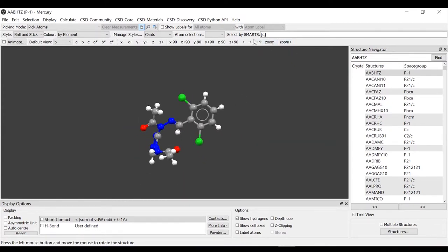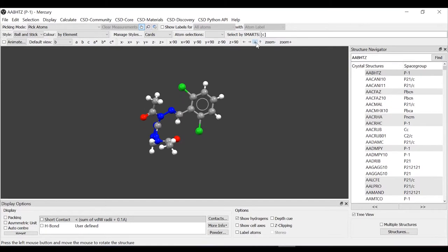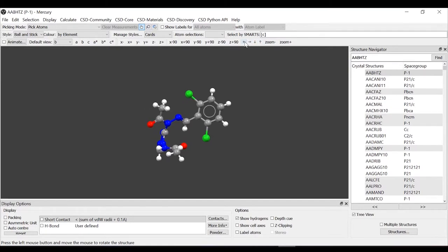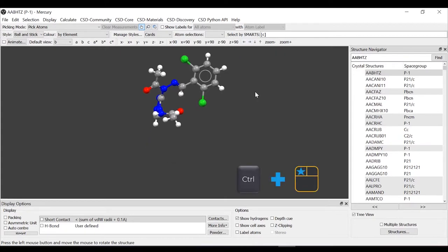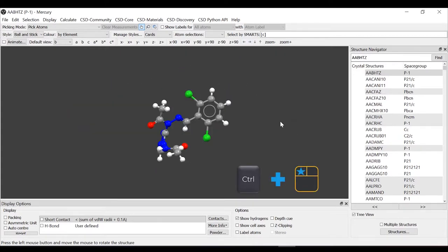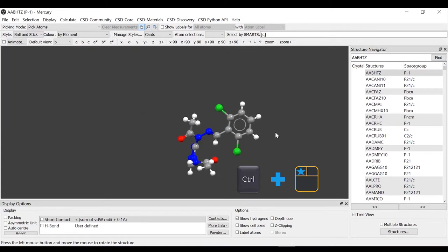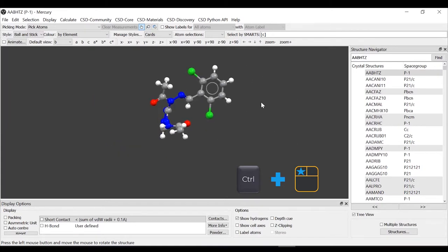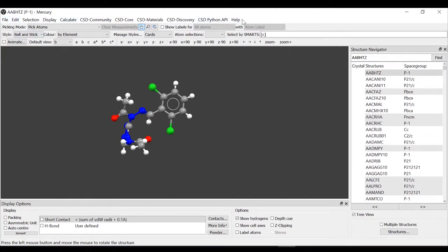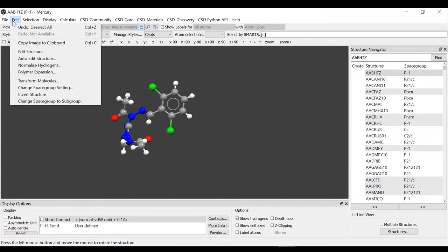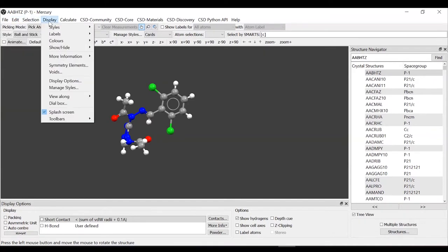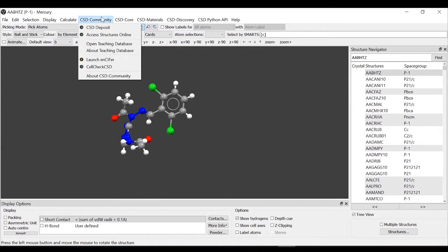You can move it with the arrows up, down, right and left, or with control and then click and drag. You can move your molecule and place it where you prefer. We have a series of menus at the top here. We will be using the file menu and the display menu today and calculate as well.